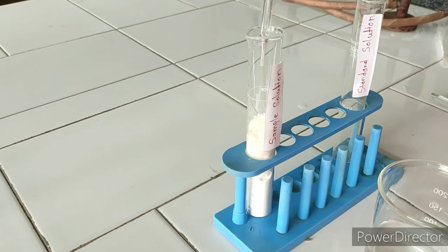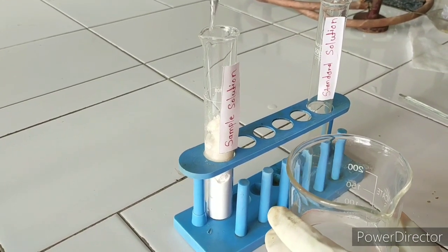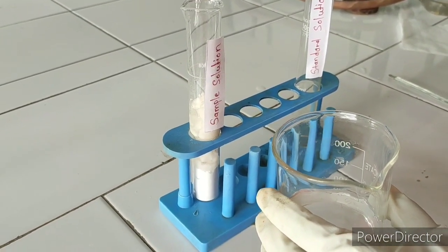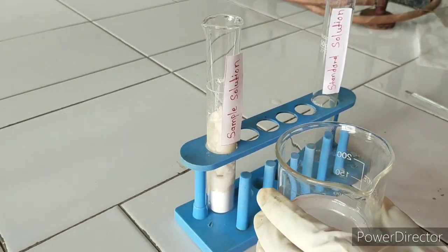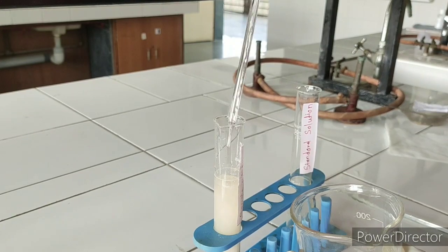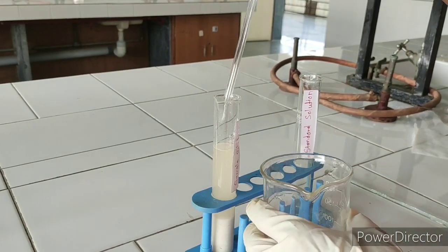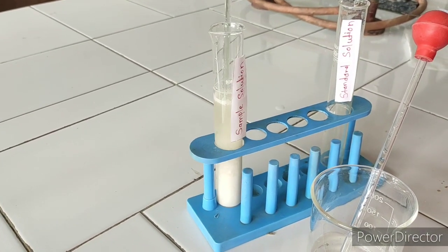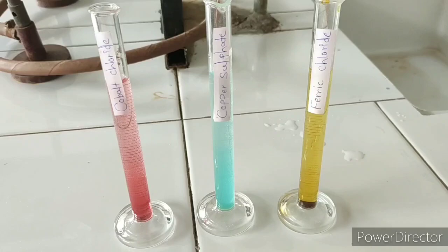Now, to prepare a solution of dextrose, dissolve 25 grams of dextrose in purified water up to the mark of 50 ml. Add water continuously and stir it. Stir this solution continuously until the dextrose anhydrous is completely dissolved in purified water.